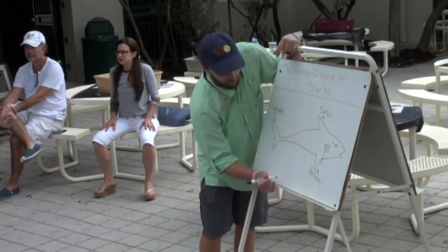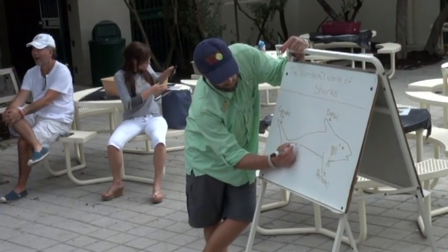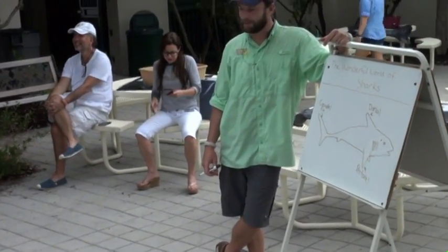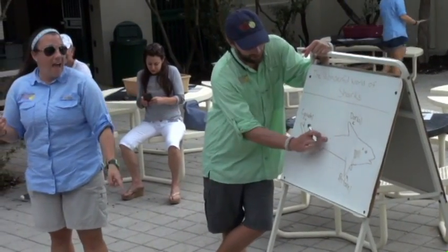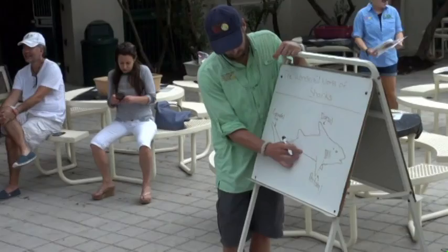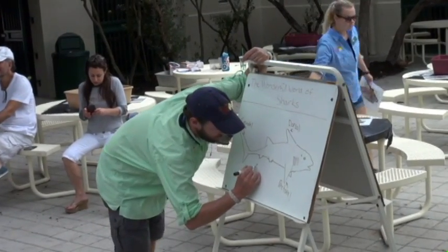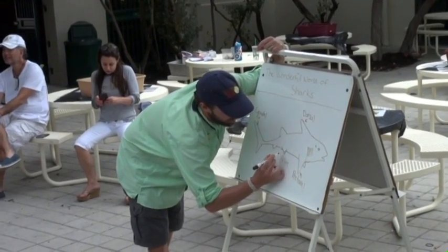Now, there is another tiny little fin right here. It's called the anal fin. Now, some sharks have them, and some sharks don't. They act like a rudder on a boat. But yes, they actually help these guys move around in that area. Now, there is another set of fins. Okay? So many fins, because some sharks have 2 dorsal fins. Some have 2 anal fins. The next group that we have is new, they're called pelvic fins, and they're found right here. The pelvic fins, and we're going to see this when we dissect our sharks, are going to tell you whether you have a male or a female. And we'll talk more about that when we do our dissection, because each shark is going to be different.